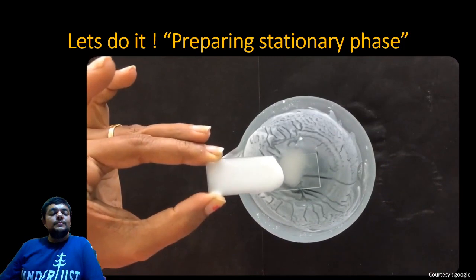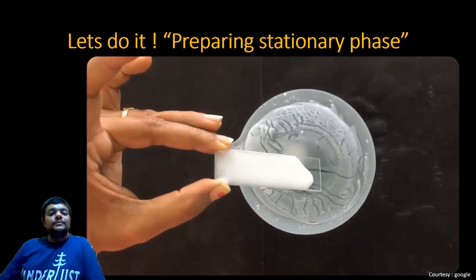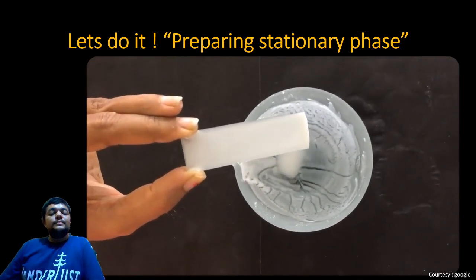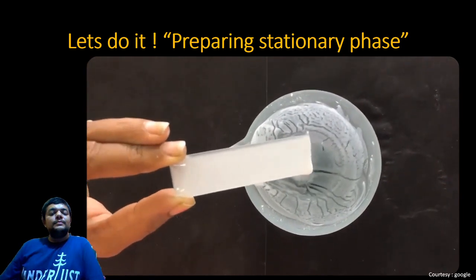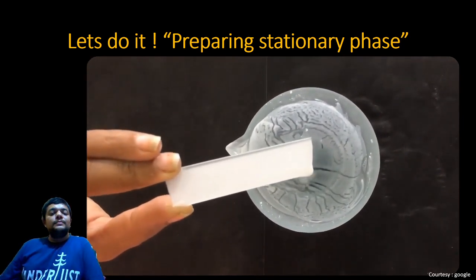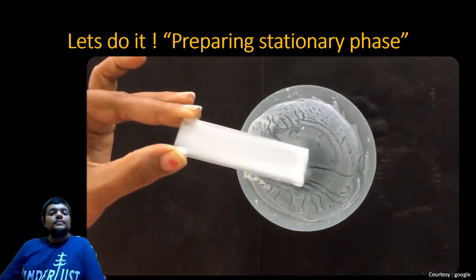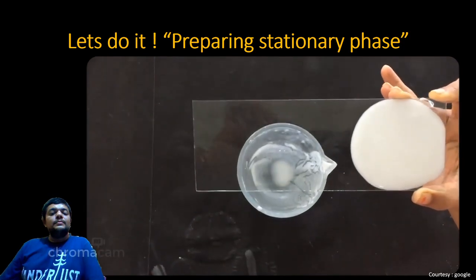move the plate around to spread the slurry uniformly over the glass plate and to form a thin uniform layer of adsorbent of about 0.2 to 0.3 mm thick. Make sure that there is not any uneven spot on the plate and remove the excess slurry over the plate. Similarly, you can follow the same procedure to coat the big size glass plate with the slurry.